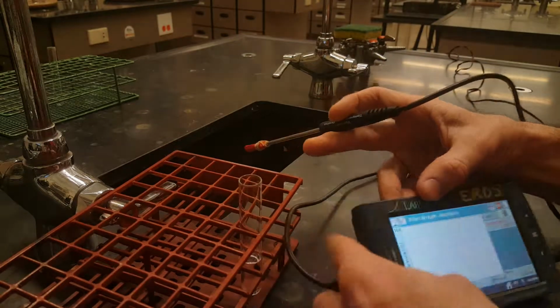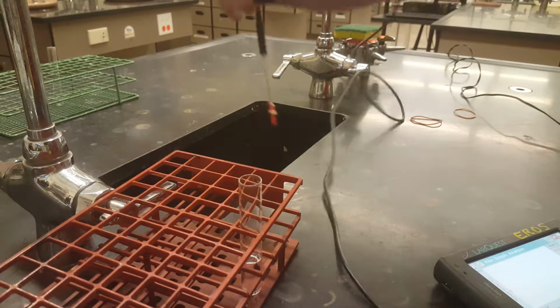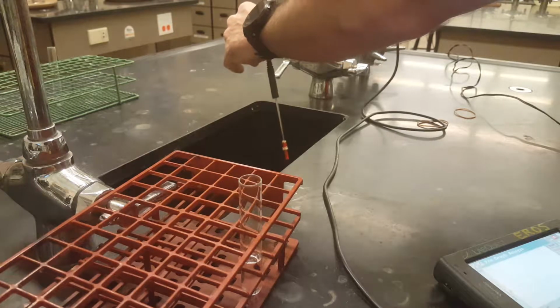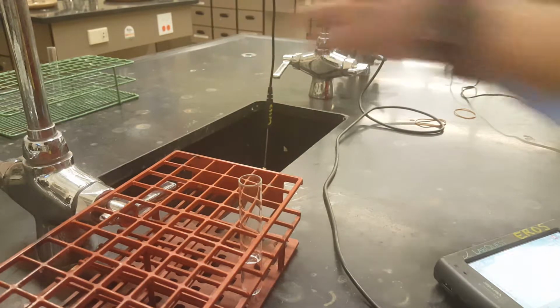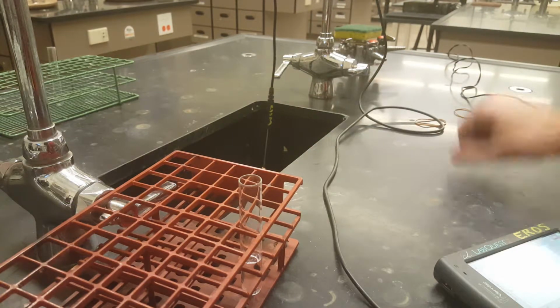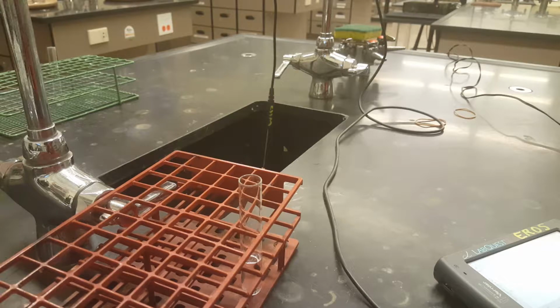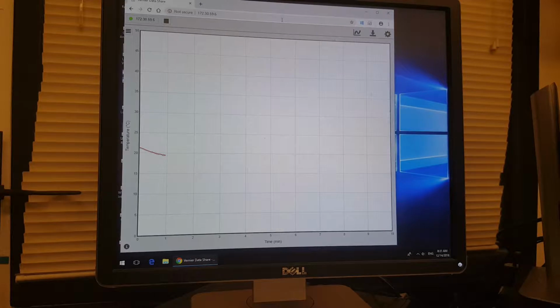Now I'm collecting data, and I want to take this and drape it over my faucet so it's down in the sink, but not touching anything. And it's like a foxhole down here, and it protects it from the wind, so we can control the rate of evaporation by controlling the flow of air over our volatile liquid. All right, and back to your screen.